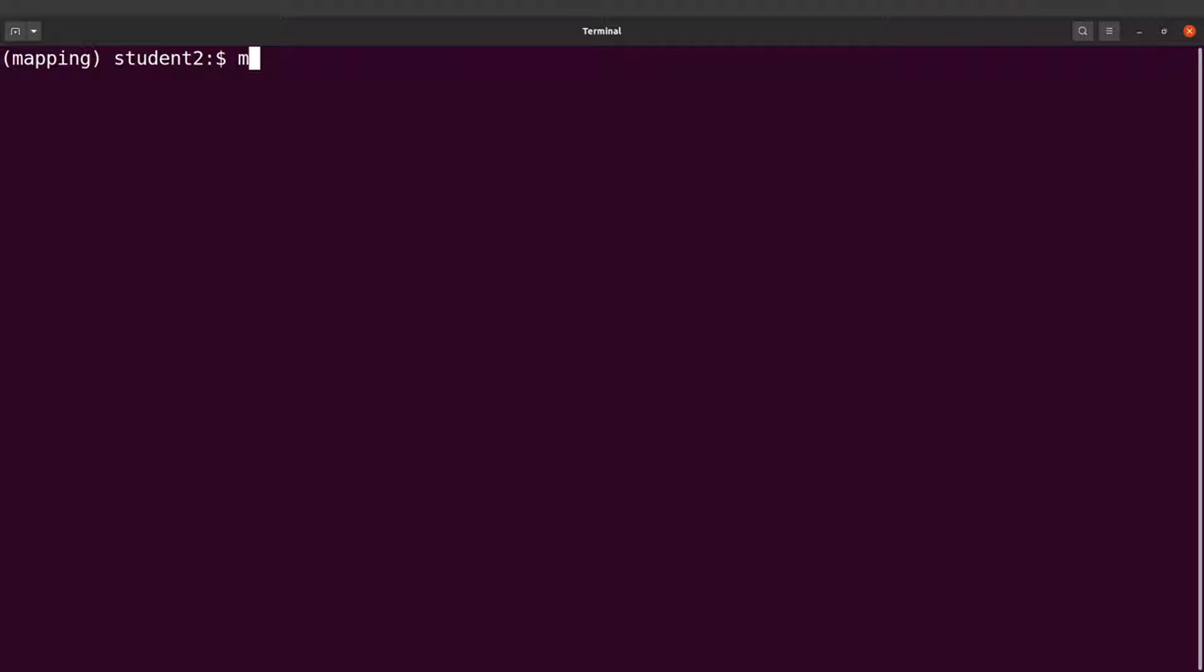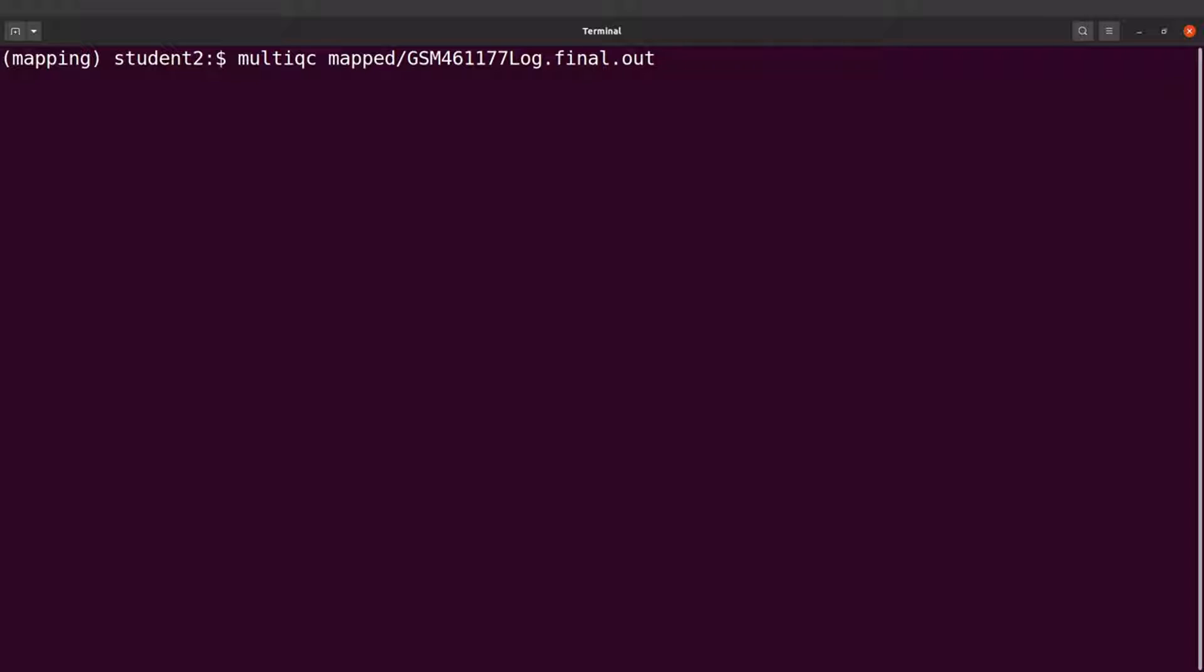So I will say multiqc and then I will specify the log file which is mapped and then I give the name. So let's run this command.